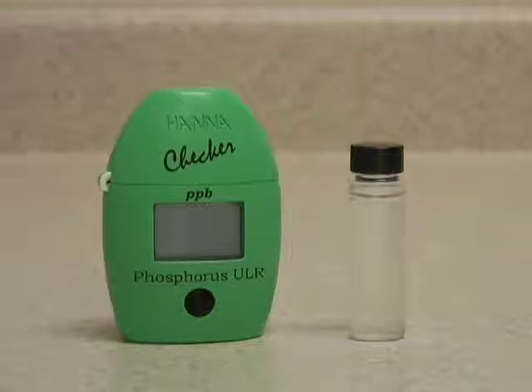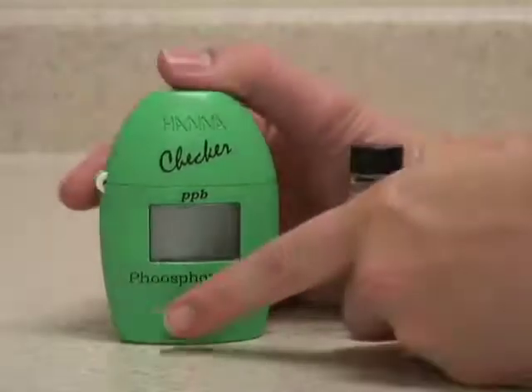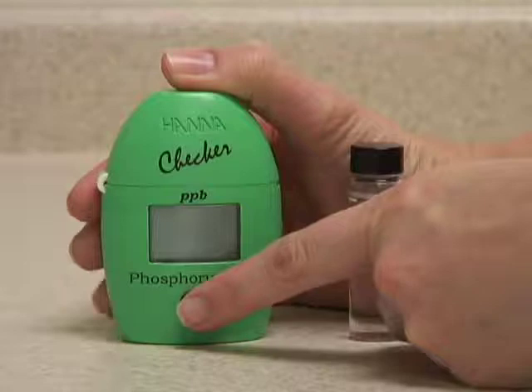This is the HANA Checker Ultra Low Range Phosphorus Meter. This meter has single push button operation. Press the button once to turn it on.